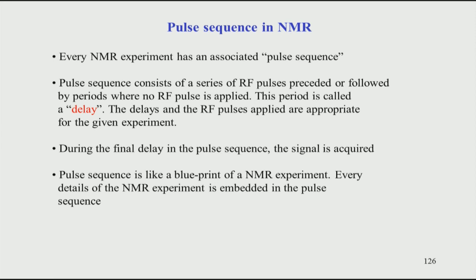In NMR spectroscopy, one thing one has to understand is that it is very critically dependent on the parameters. These days many of the commercially available spectrometers have all these parameters set by default. So, many of the users, students and others who record NMR spectra, never actually get to see these values, never get a feel of these values, because they are all set by default.